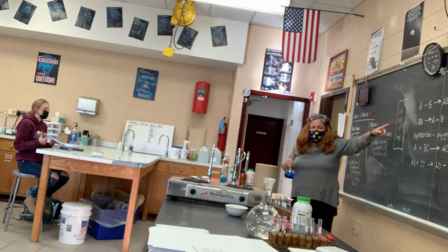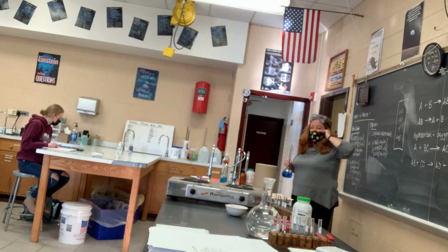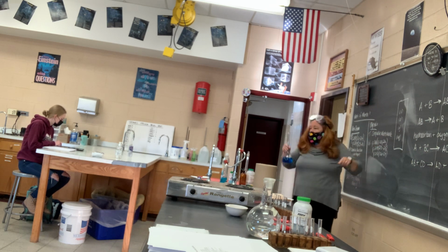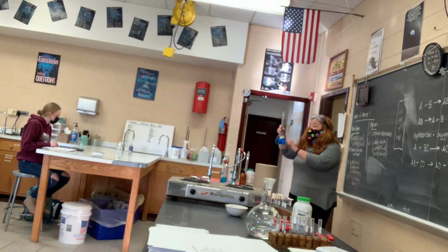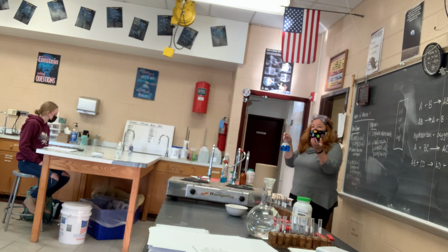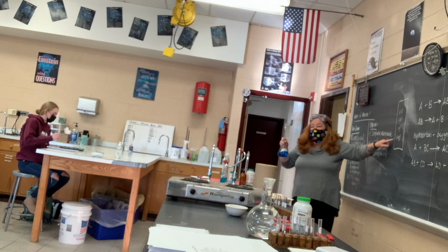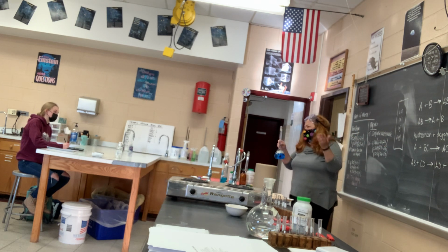The liquid, I don't think I've actually used a true liquid. Oh, no, not even hydrochloric acid's aqueous. Aqueous is what most of our solutions are. So what I've done to make this means saturated copper sulfate. I took copper sulfate, a blue powder when I buy it from the chemical company, and I put it in distilled water. That's what aqueous means. I've taken a solid and I've dissolved it like Kool-Aid.